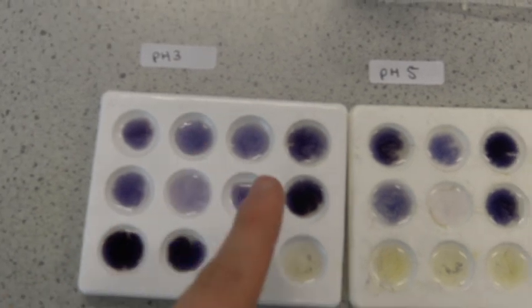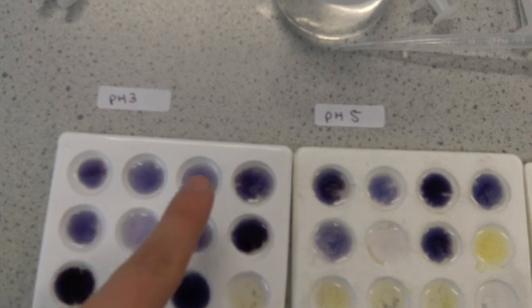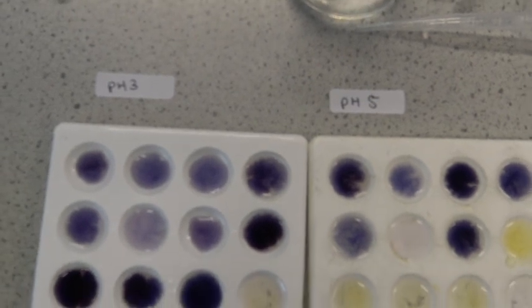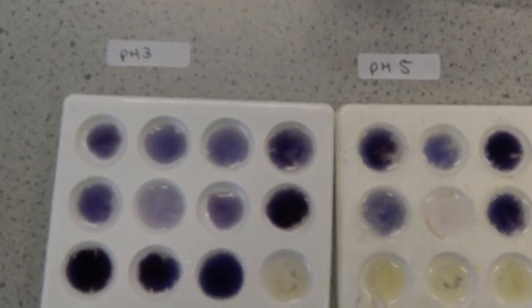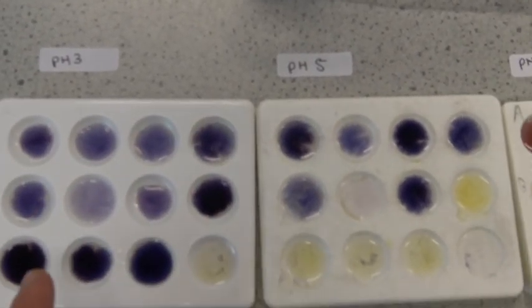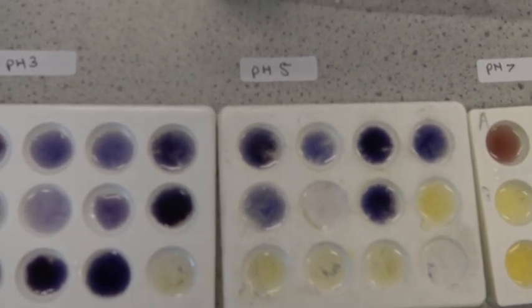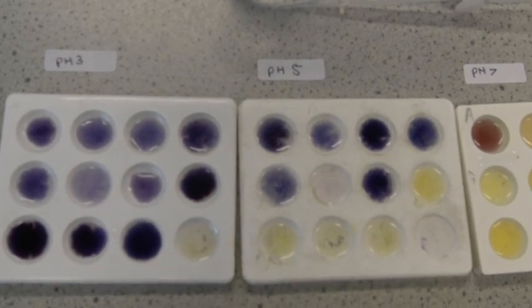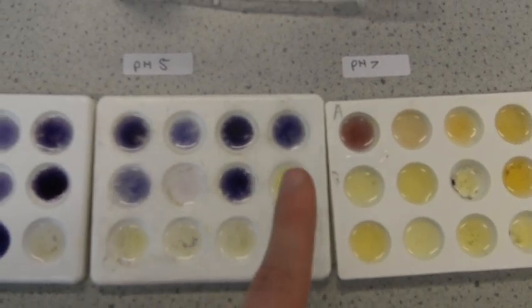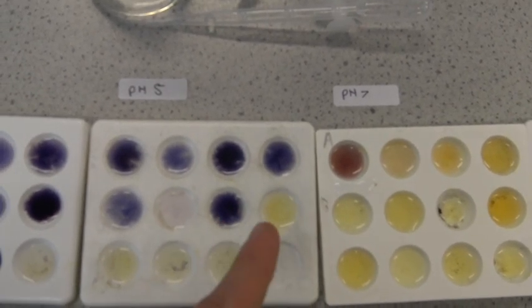Each time we go across one box, we go up by 10 seconds — so 10, 20, 30, 40, 50, 60, 70 seconds. For pH 3, you can see that starch is present all the way up until 110 seconds. Then in the last one the iodine hasn't changed colour, showing that the starch has been converted to glucose. At pH 5, it takes less time — the starch is fully broken down after around 70 seconds.